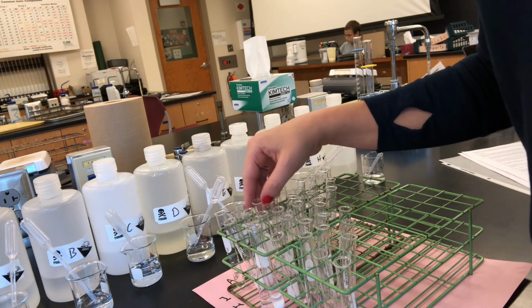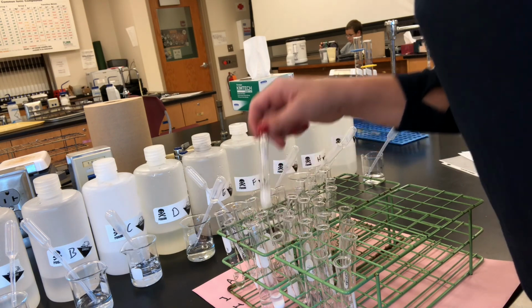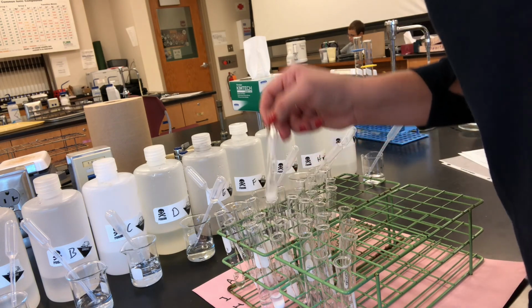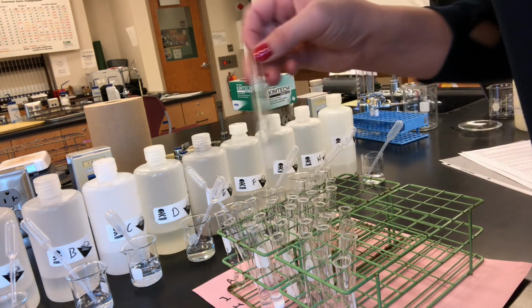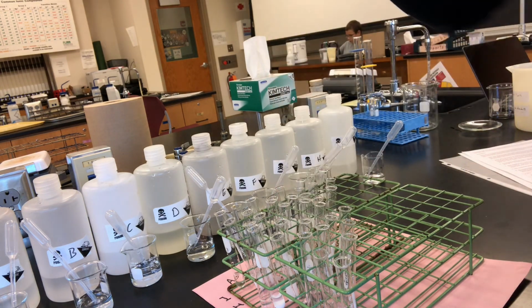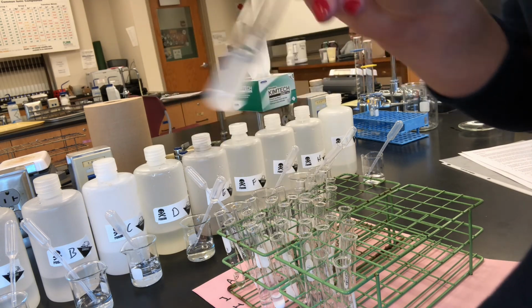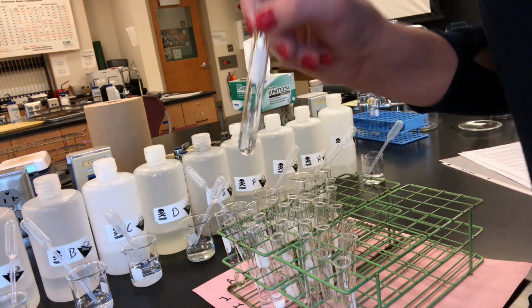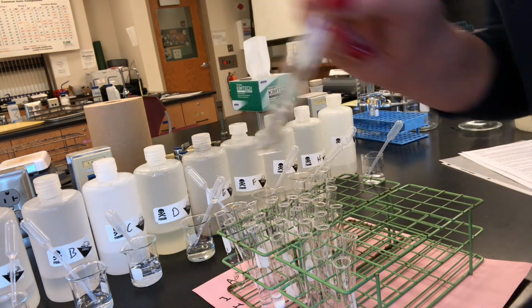All right, C and I, no change. C and H, white precipitate. C and G, white precipitate. C and F, white precipitate. A very faint one. There's not a lot going on in there. That might be worth noting. C and E, no change. C and D, no change.